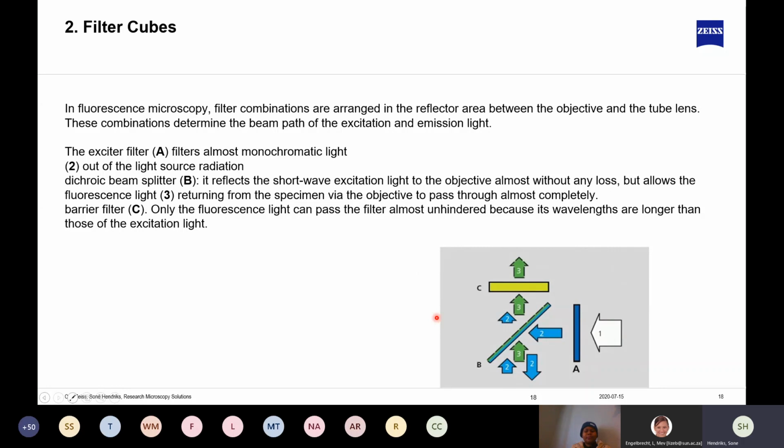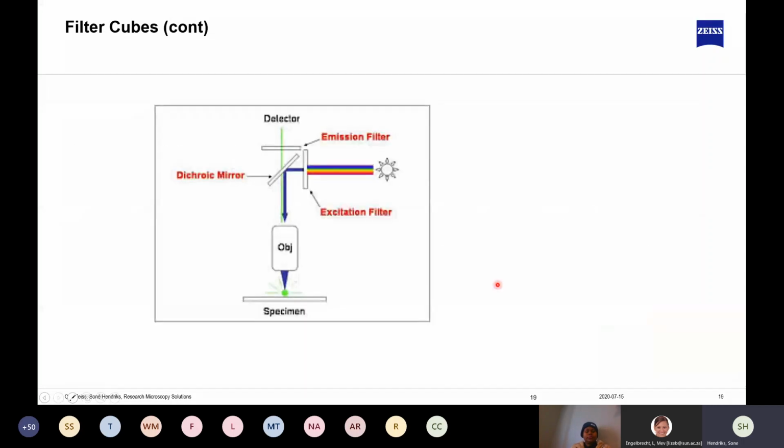You can lose a lot of light, because if your excitation or emission filter blocks out any of the wavelengths of the light of your molecule of interest, this can result in a very dim sample or no fluorescence at all. So these are some of the things that you can check if you don't see the type of signal that you expect down your fluorescence microscope. All right, that's just a different diagram, again, to show it in a different way.